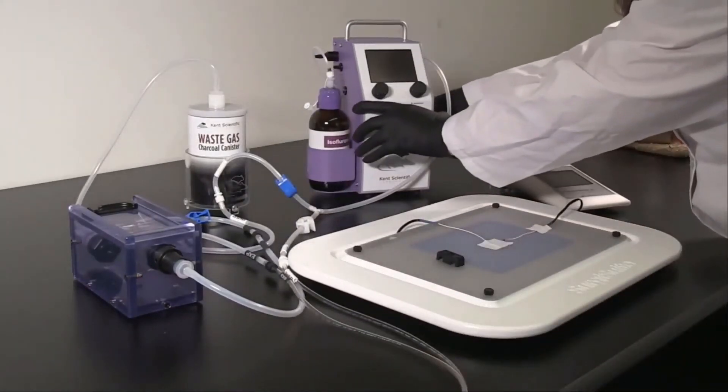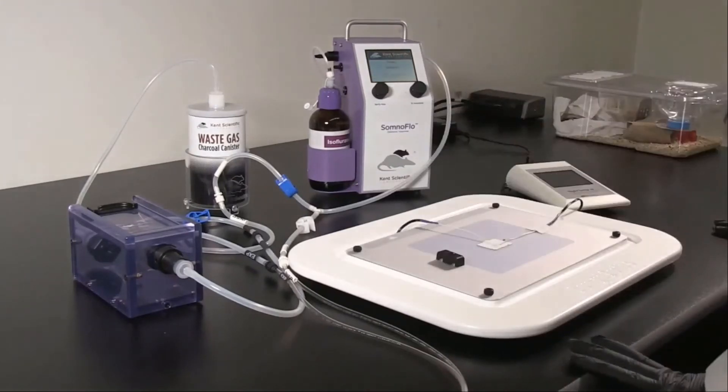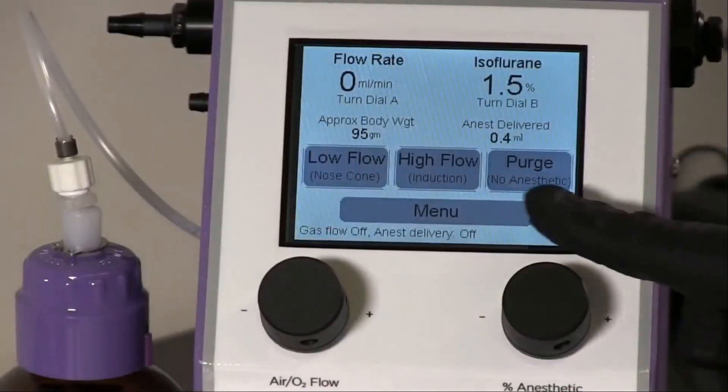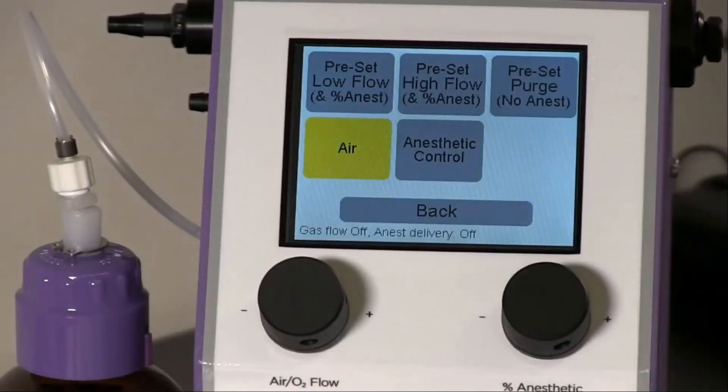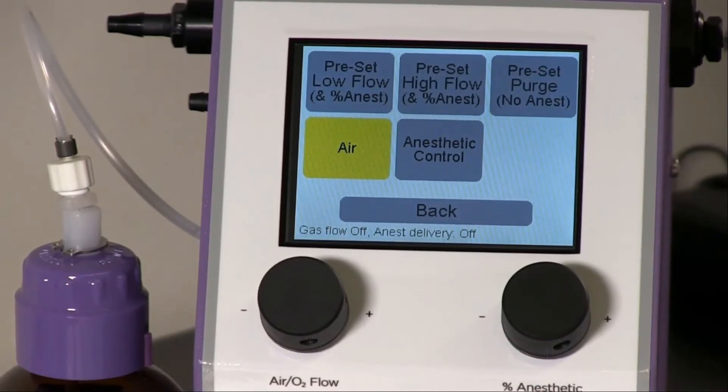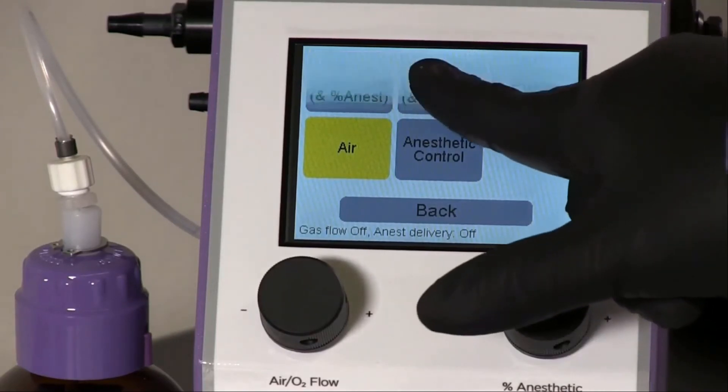Turn on the SomnoFlow to begin the automatic priming sequence. The system will draw anesthetic directly from the bottle and prepare the system for delivery. Once priming is complete, touch Menu to enter the preset settings. There are three presets available to save your preferred settings: Low Flow is best used for anesthetic maintenance, High Flow is best used for induction, and Purge is best used to reduce excess anesthetic in the induction chamber. The SomnoFlow will save all of your settings, but you can return to this menu at any time to adjust the preset options.